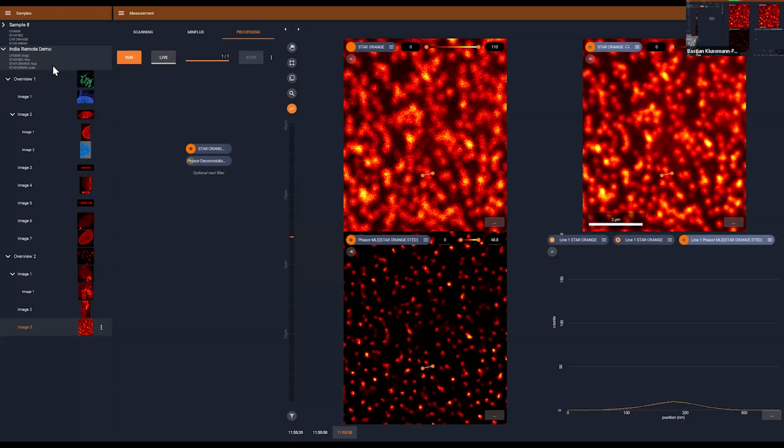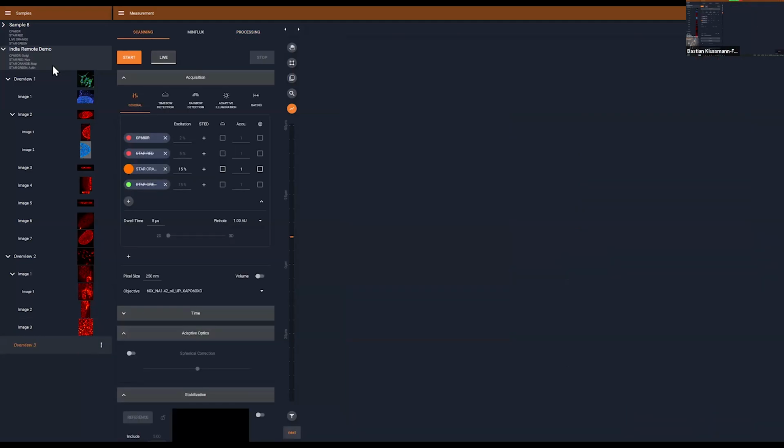And the reason for that is that, especially when we work with high magnification objectives, you have spherical aberrations in your sample. So sample-induced aberrations, which are induced by refractive index mismatches between your sample, your immersion medium, and the glass, and so on. So what I have here is, in this case, fluorescent beads in a 3D matrix, because there it's very nice to highlight what actually happens when you have spherical aberrations.